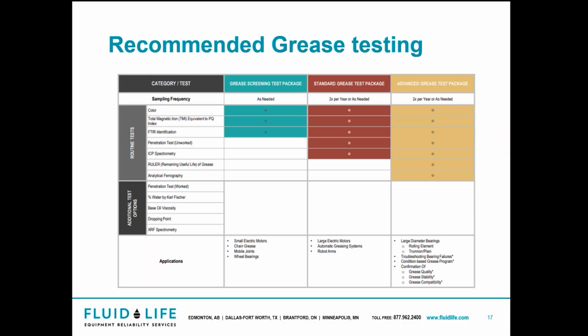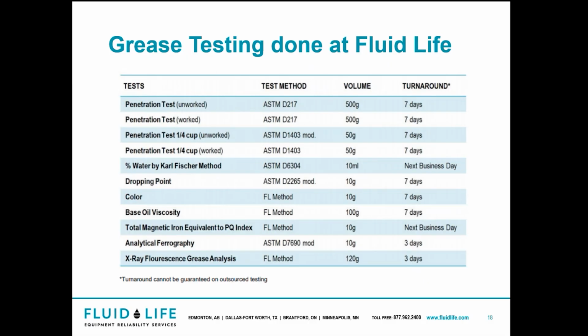Now, XRF spectroscopy, we've kind of moved away from and are leaning more towards scanning electron microscopy to examine. And all the tests have their turnaround time, the ASTM methods that we use, and how much grease we would need to do that.